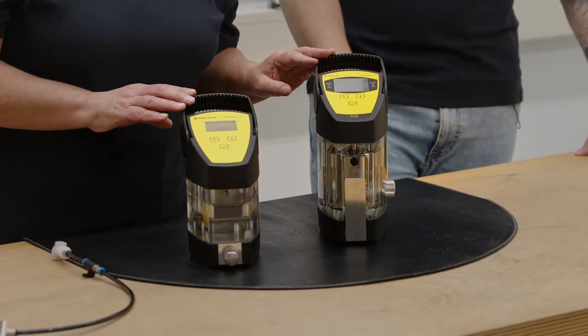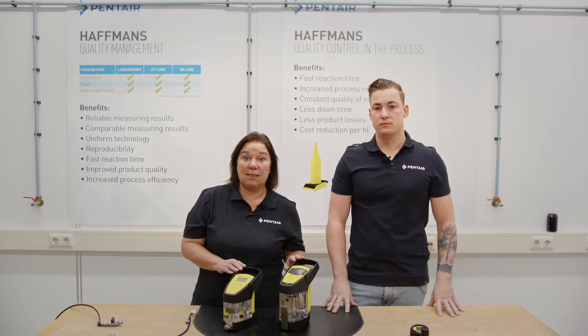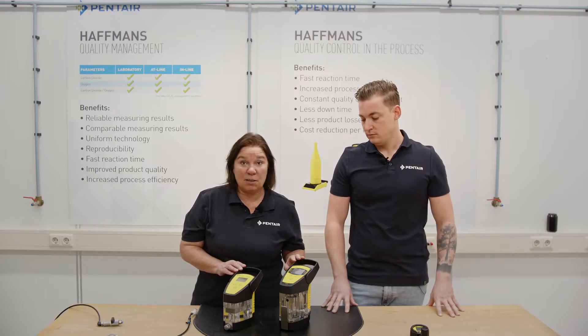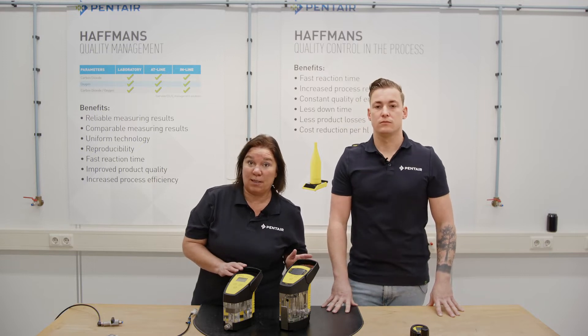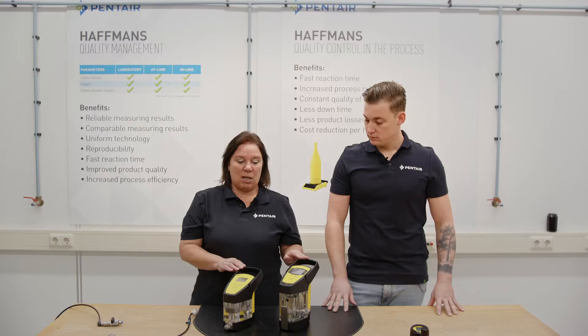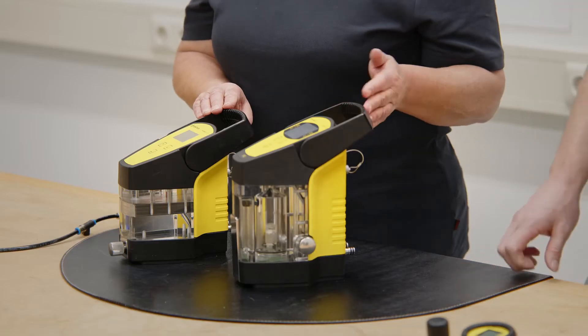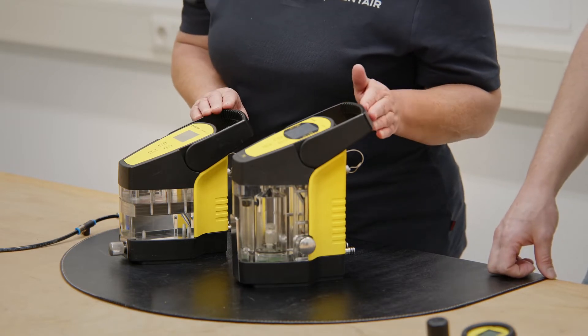The Gehaltemeters with oxygen sensor measure dissolved oxygen in carbonated and non-carbonated products like beer beverages, but also in deaerated water. This selective oxygen sensor also measures the oxygen in a gas — for example, it is capable to measure the purity of a CO2 gas.